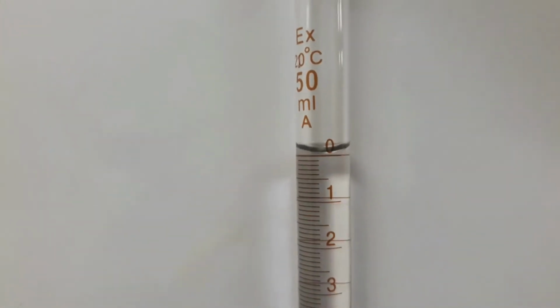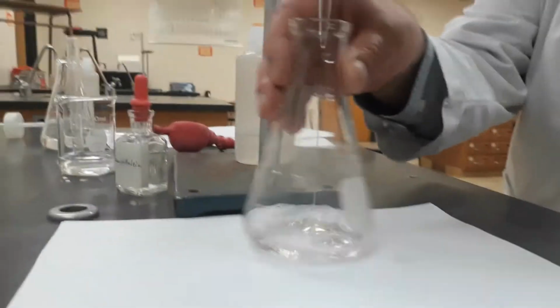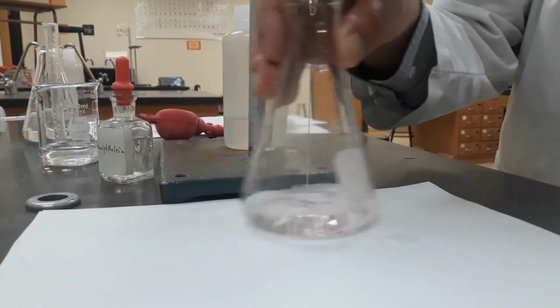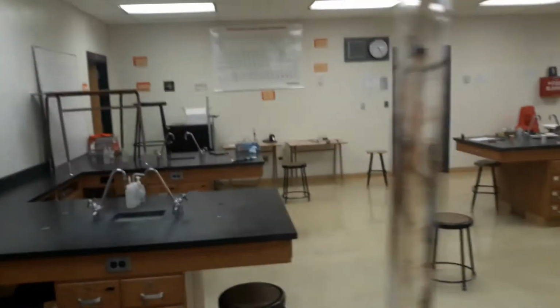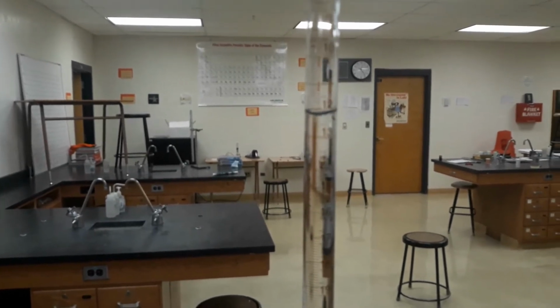So here's our first titration. There's our initial reading. And then we'll titrate. See, it's taking quite a bit less than the last time.